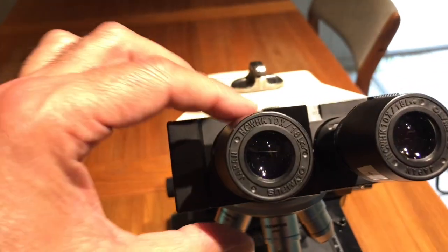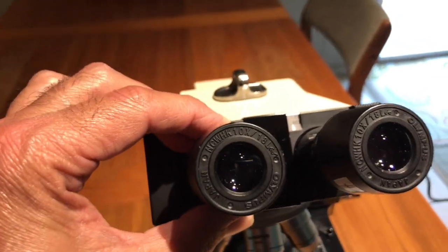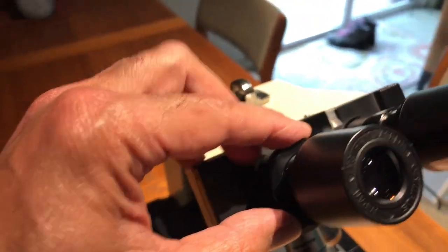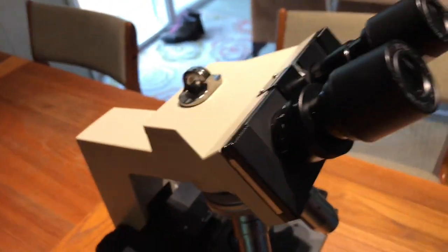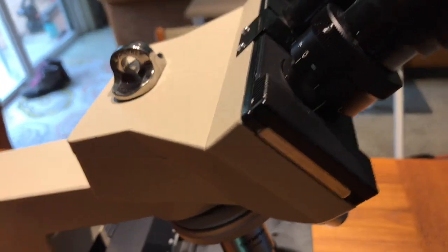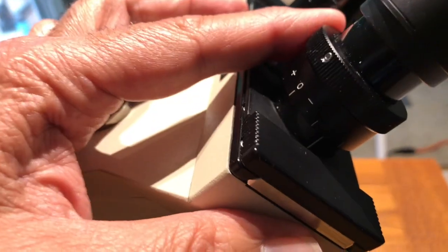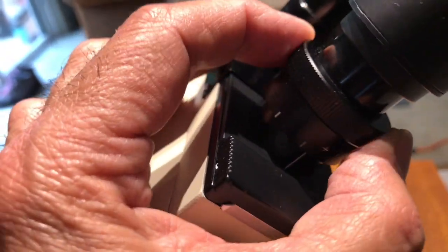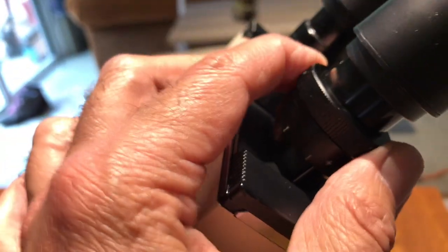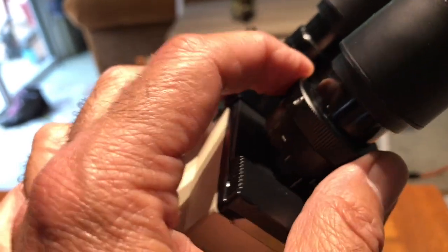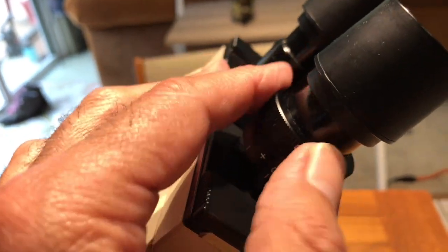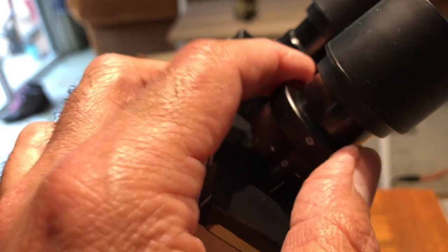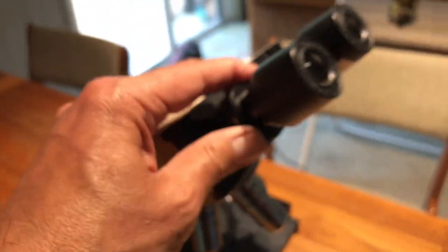Starting from the top, we have the two eyepieces. The left eyepiece has what is called a diopter, which you can use to adjust to your left eye. Usually our eyes are a little bit different, and so this allows you to correct for the differences between your left and your right eye.